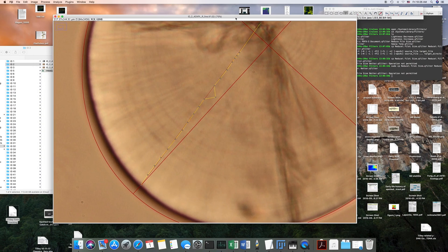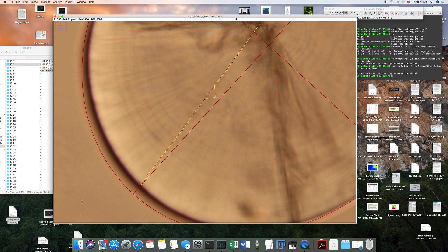Again, I'm just going to leave it at that. I don't want the file size to get too big, but that's kind of the basic way that I use to measure otolith increment widths.